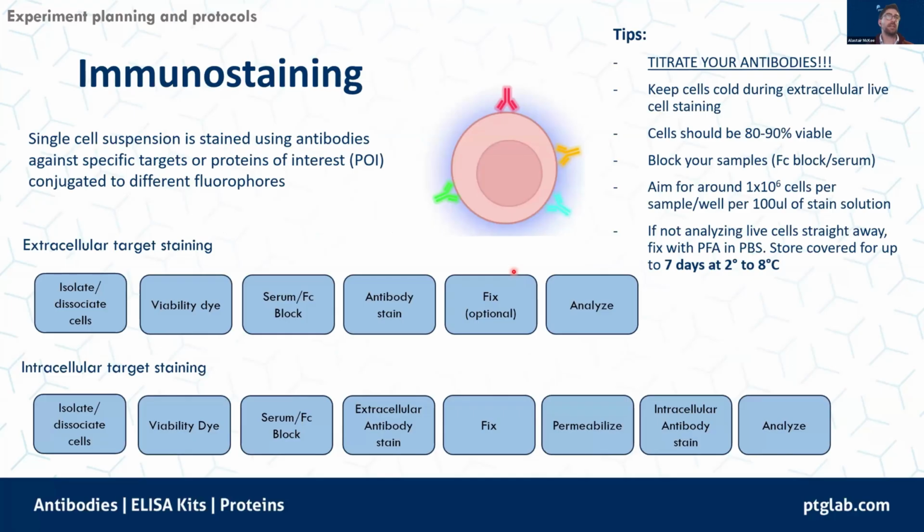In terms of immunostaining, it's really important to try and understand the biology of the proteins that you want to investigate in the context of where you expect to find them within the cell. I know often people are handed a protocol by postdocs or a PI or wherever it may be, and you're just told to follow that. But sometimes, if you're adding new targets into a panel which was designed for extracellular staining, then you need to consider if you need to introduce any fixation and permeabilization to access those particular targets.